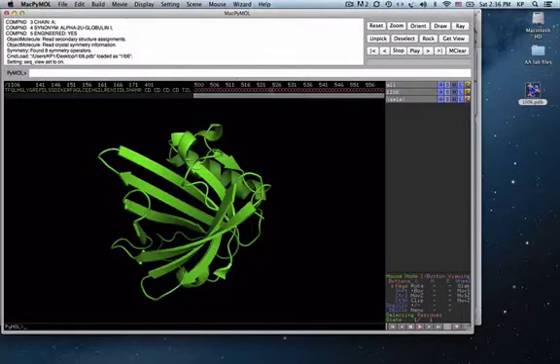These O's are all the water molecules that have crystallized with this structure. Crystal structures are actually very wet protein crystal structures. A small organic molecule might crystallize without solvent, but these have to be crystallized with some water molecules associated with them, or they'll lose their biological shape if they dry out.